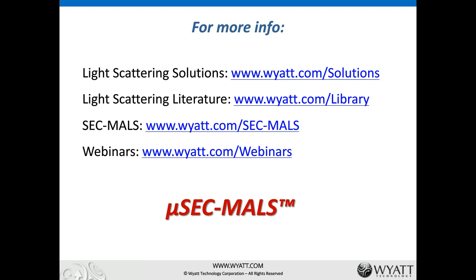Okay, great. Does conformation affect the molecular weight determination, and why, for synthetic polymers? The conformation does not affect the molar mass measurement. In MALS, when we make a measurement of the molar mass, it's a global fit of two important parameters. One is the molar mass. The other is the root mean square radius. These two components are not independent of each other. So if you have a synthetic polymer that is bigger than, say, 10 nanometers and it's got an angular dependence, the calculation of molar mass must take this angular dependence into account.